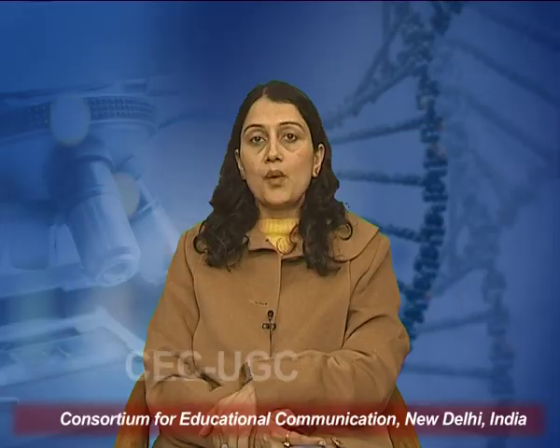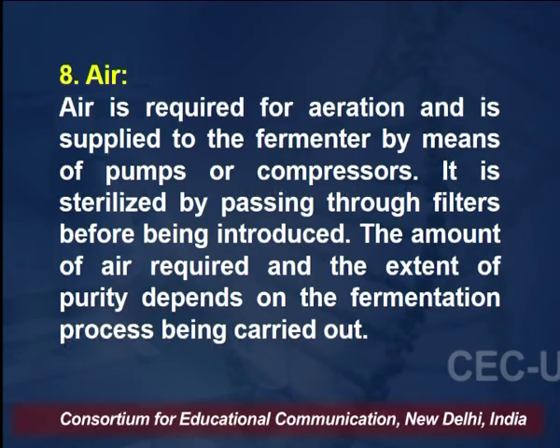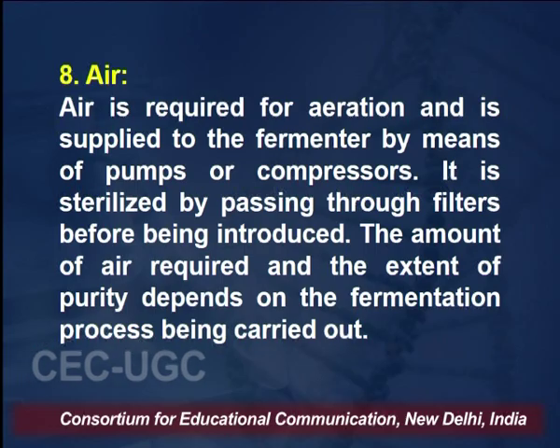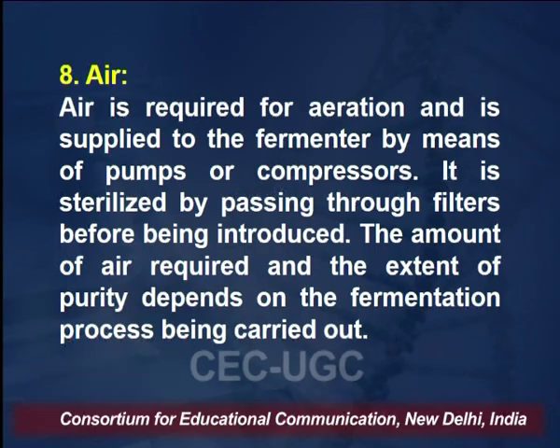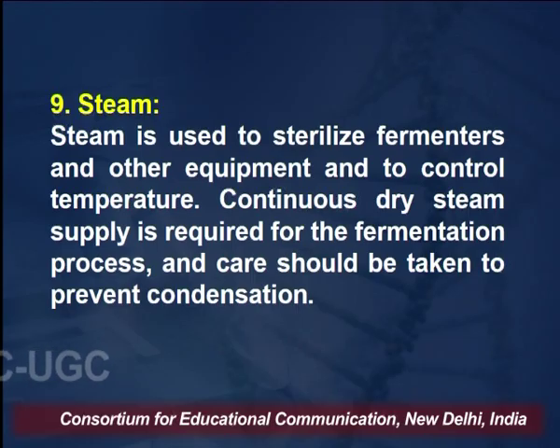The air is required for aeration and is supplied to the fermenter by means of pumps or compressor. It is sterilized by passing through the filters before being introduced. The amount of air required and the extent of the purity depend upon the fermentation process being carried out.